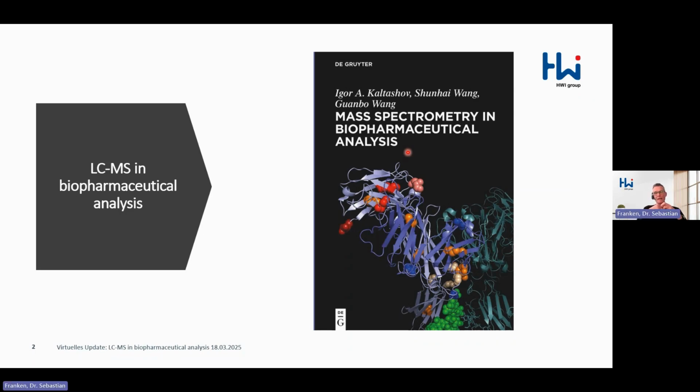Today, I would like to use a few guideline-related examples to explain what we can use LC-MS for in the analysis of biopharmaceuticals.